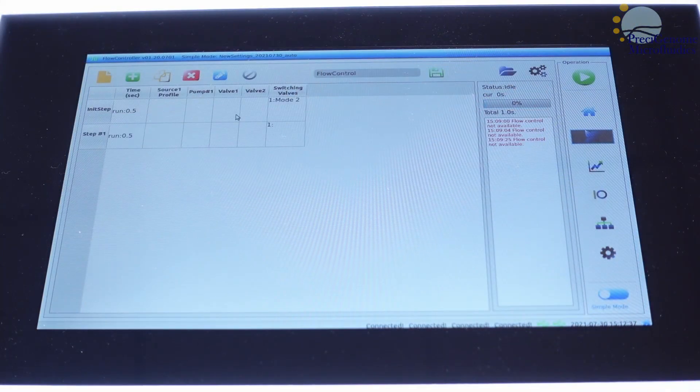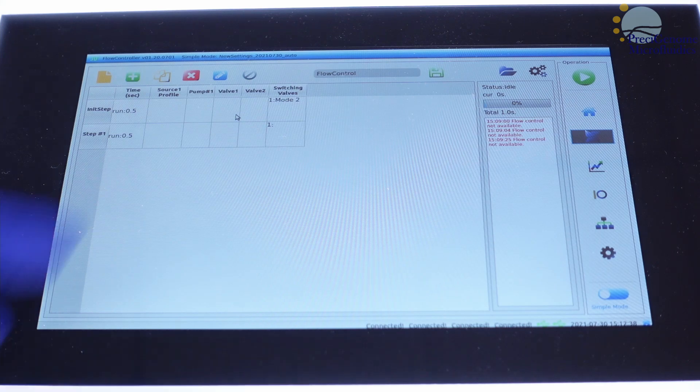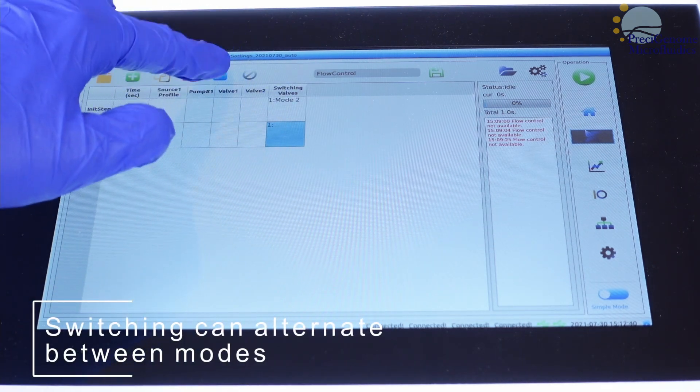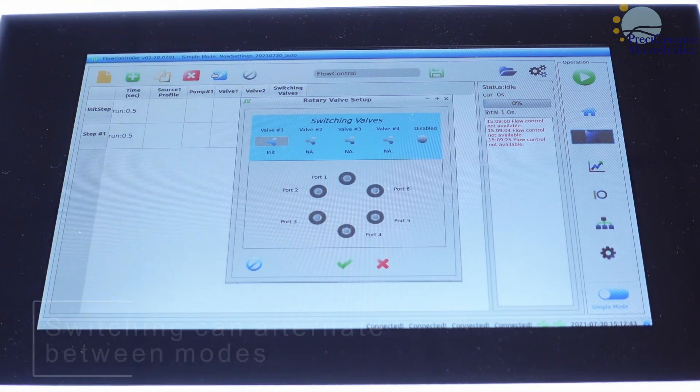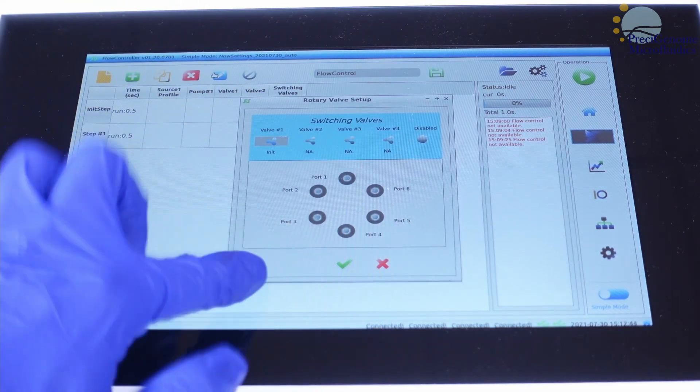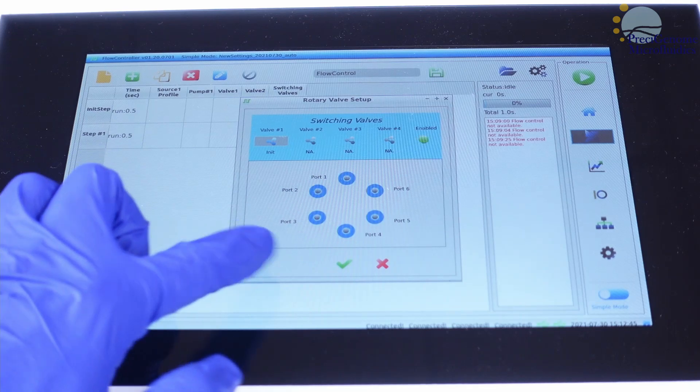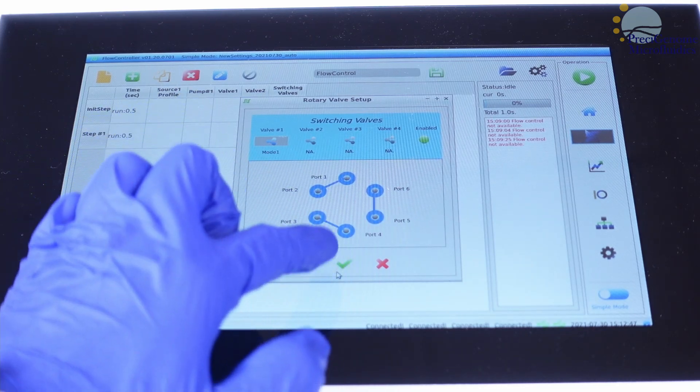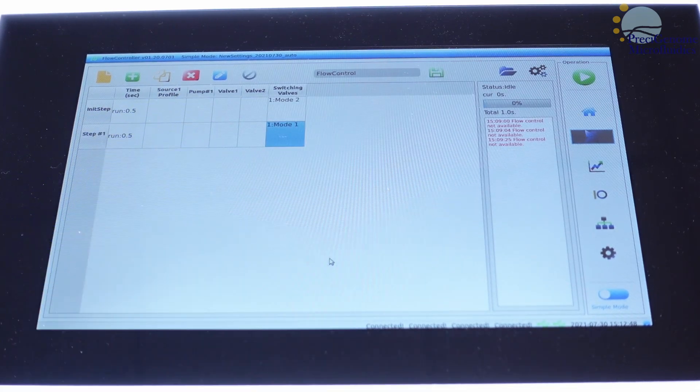The scripting menu lets us write more complex behaviors. For example, the switching valve can alternate between different modes at different steps in a script.